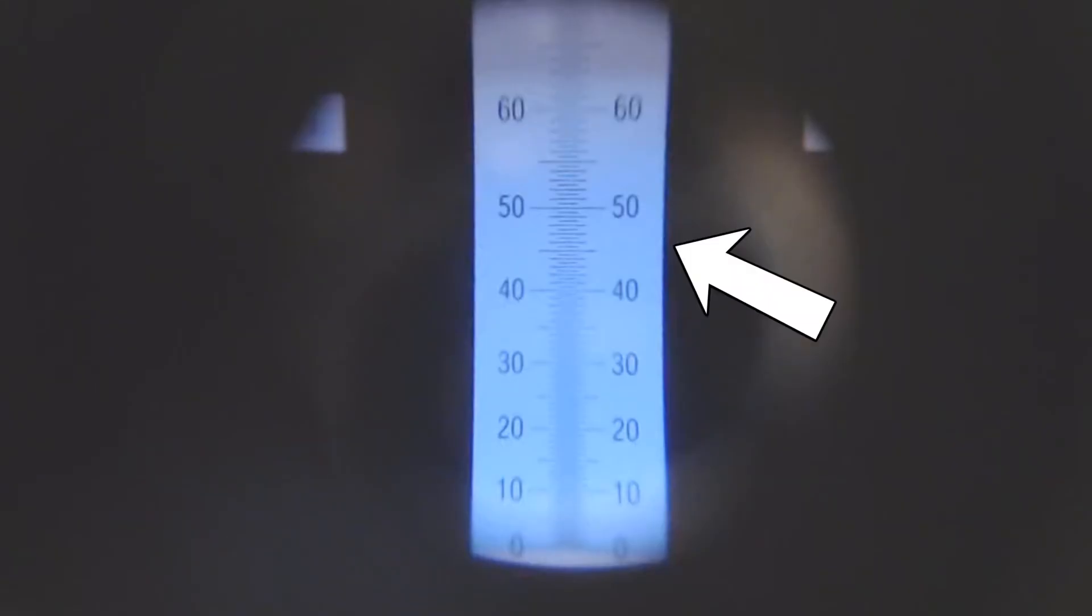You'll see a distinct blue area and a distinct white area. At the point where the color changes is where you want to take the reading.